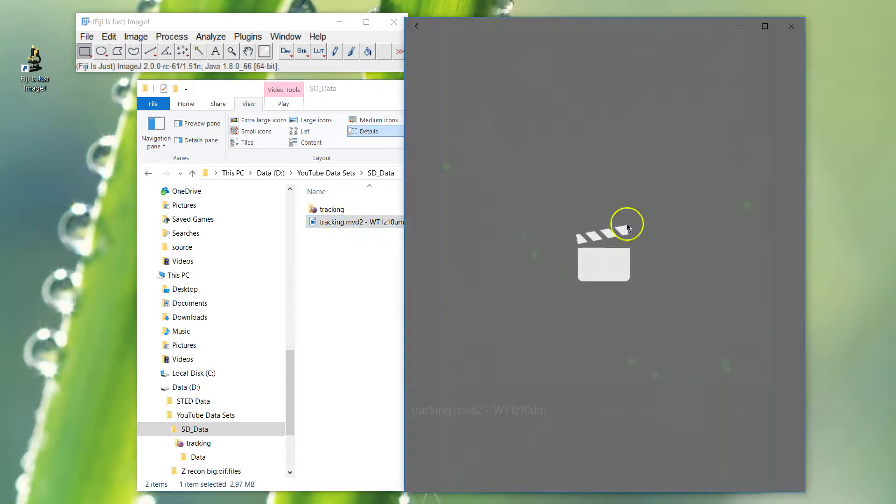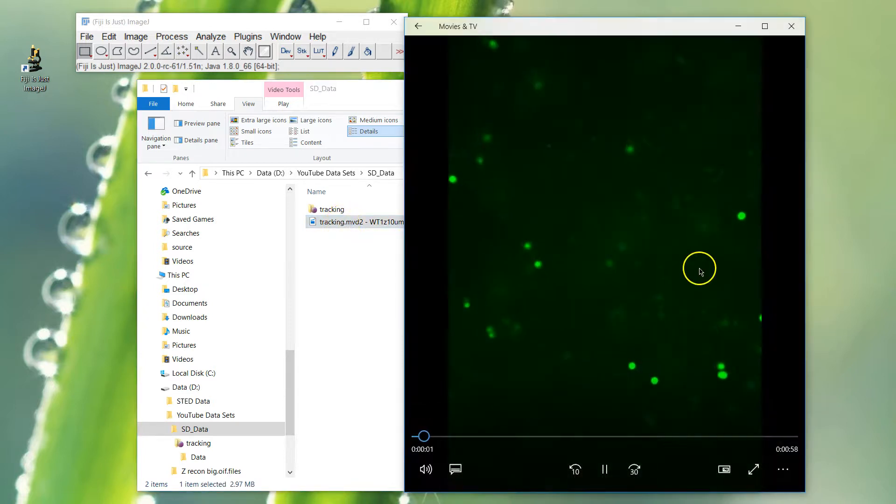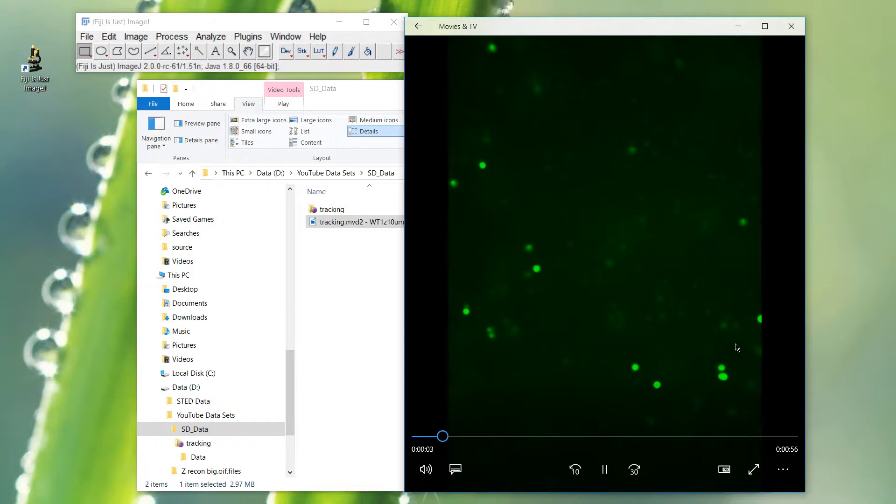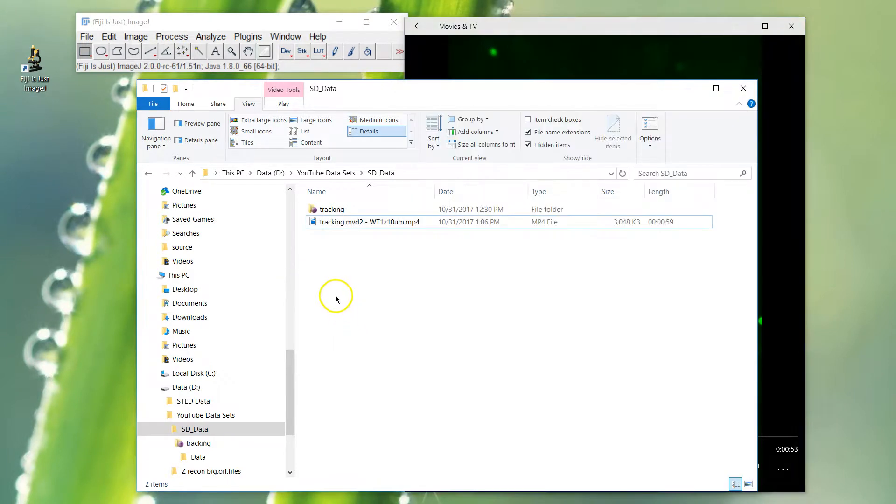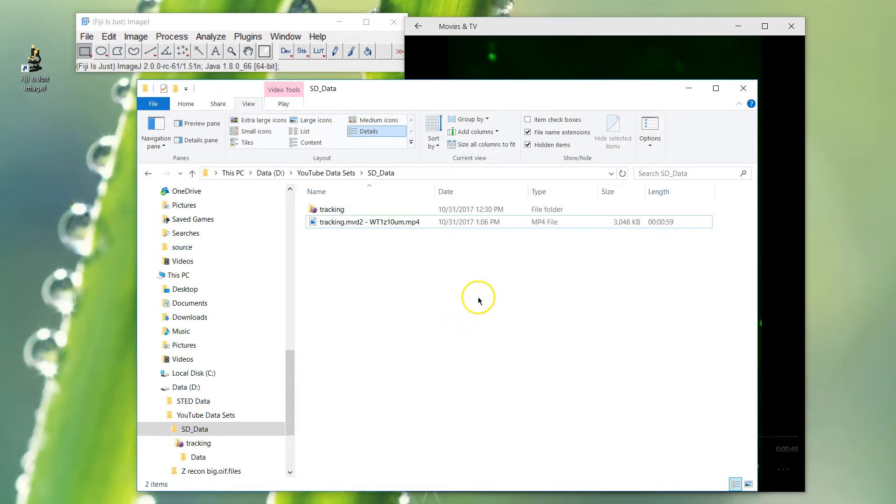So that's something you can share and put in PowerPoints. Next, we're going to do maybe a little bit more complicated - do a macro on how to pull these files in bit by bit from these project type files.